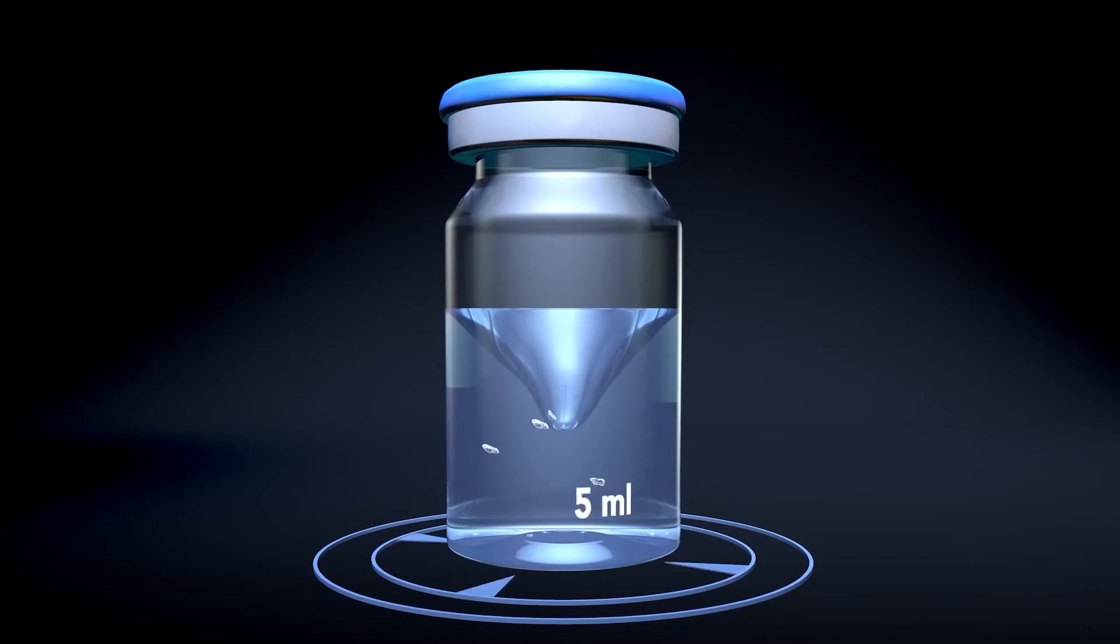By rapidly rotating the container, its liquid contents and potential particles are set in motion. Once the rotation of the container stops, liquid and particles keep moving.